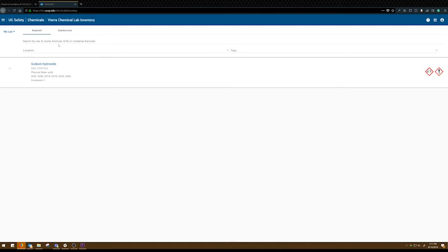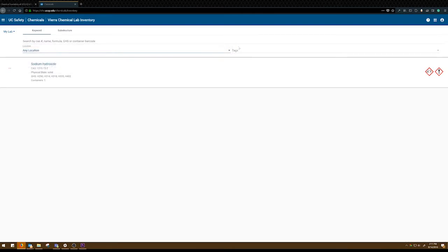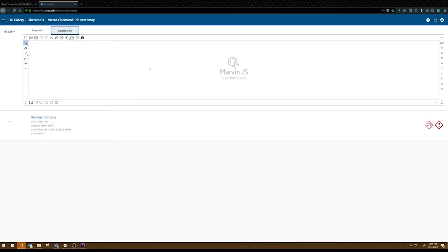You can search here by keyword, CAS number, name, formula, etc., by location, as well as substructure. With that, you'll be able to also draw the chemical that you're looking for.